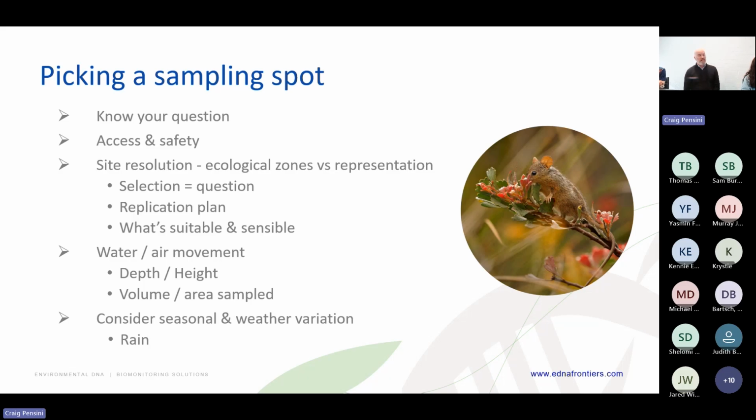That big project that you looked at earlier, the LEWA that Marina presented, they did all of that, but then ended up settling on a representative 6 replicates from one site at one side of the wetland. And that was enough to get the information from that whole wetland. Looking at all of those ecological zones didn't necessarily help his purpose, but if you're looking for rare organisms, then those different ecological zones could help.